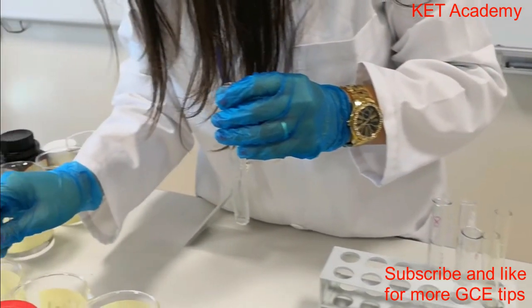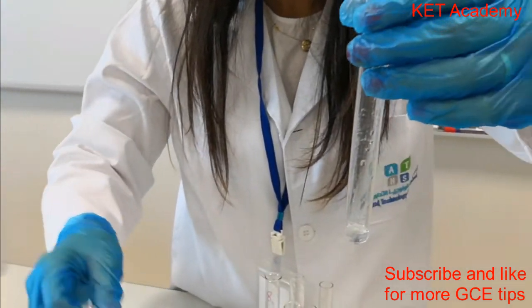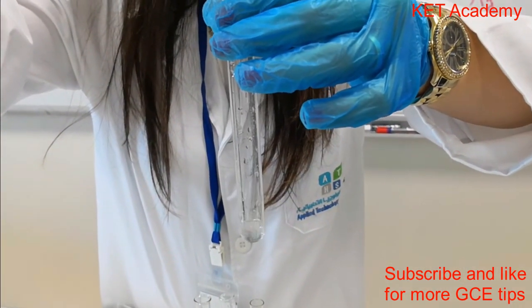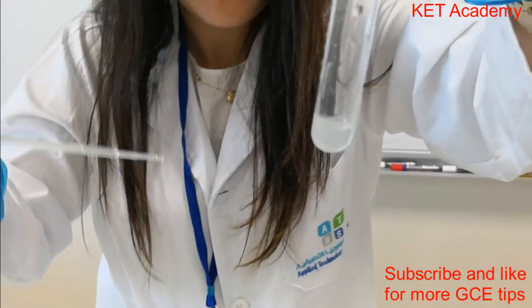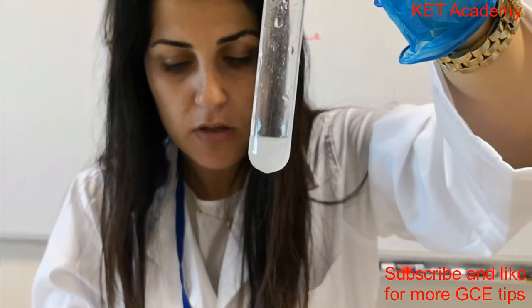Let's try now the barium. This is barium solution. This is not a precipitate, but the solution turns cloudy.